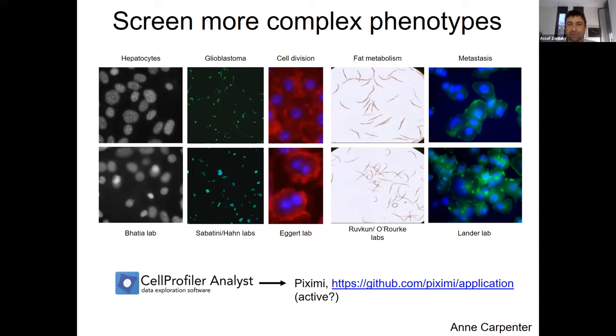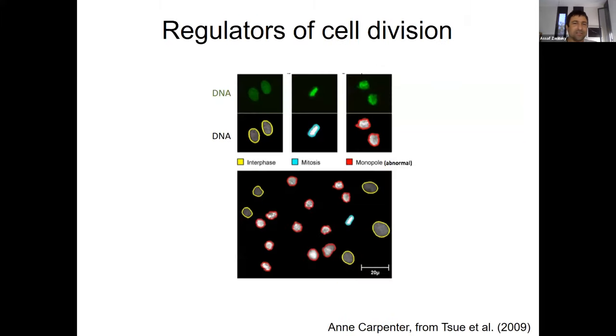I'm not sure about that because I checked, and it seems that previously CellProfiler analysts gave a platform to do this type of thing, and they were promoting a new platform called Piximi, but I checked it and it seems that it's not very active, so probably it's not relevant.